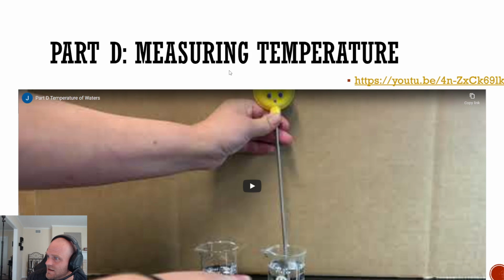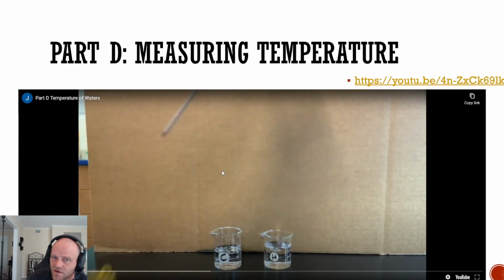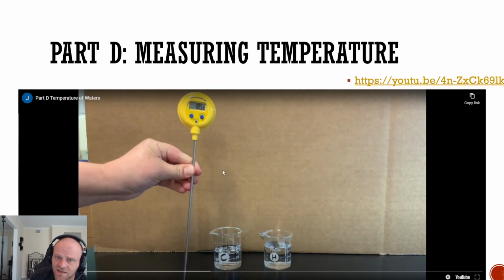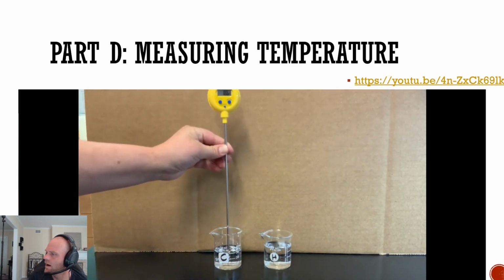Let's see. And now here's part D, measuring the temperature of waters. Okay, and like I said, I've also included the link here in case this video doesn't open for you, but I'm going to play them for you so you can always come back to this video if you want.